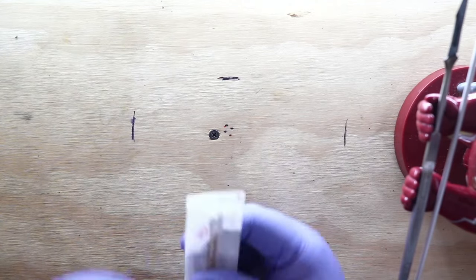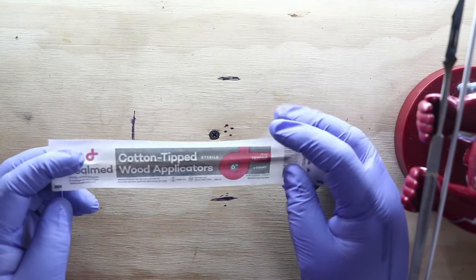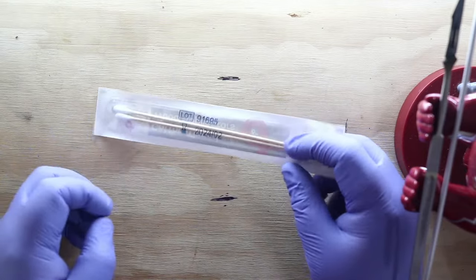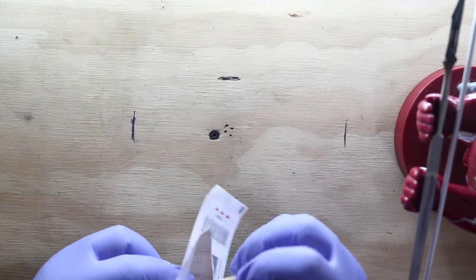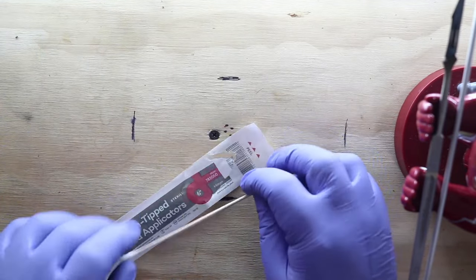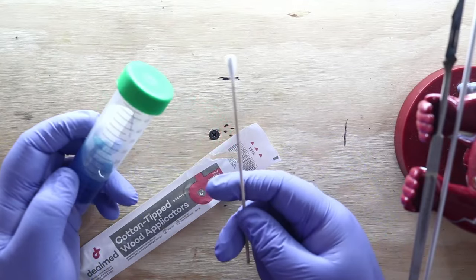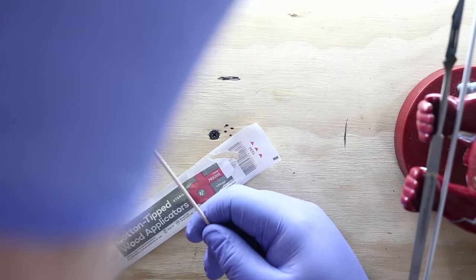Okay, so these are swabs, just cotton-tipped wood applicators. You can buy them sterile or non-sterile. I get them sterile. This is another good way, if you don't want to use an inoculation loop, to do your spore streaks. I also use these to collect samples of molds and things, and then you can just put them in a slant without anything in it, break it off, and then you've got swabs of contaminants or anything else that you can send off for DNA testing.